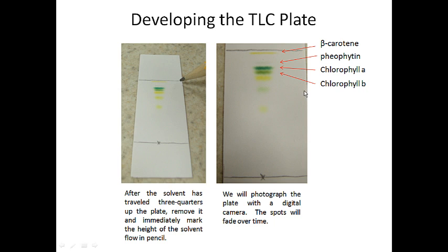But if not, we'll be taking digital pictures, and since each group is going to be doing this, we'll need to take pictures of this so everybody has a copy of the TLC plate and what it looked like. But nowadays, with everybody with their iPhones or whatever phones, they probably have a better camera than I may use to take these pictures with.